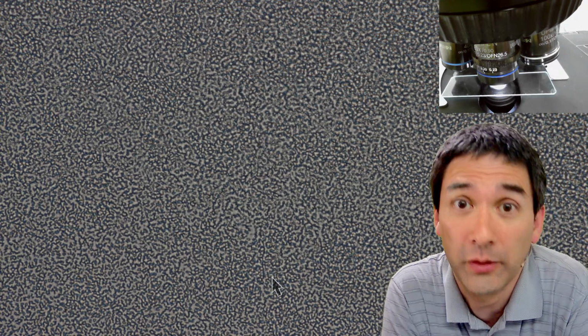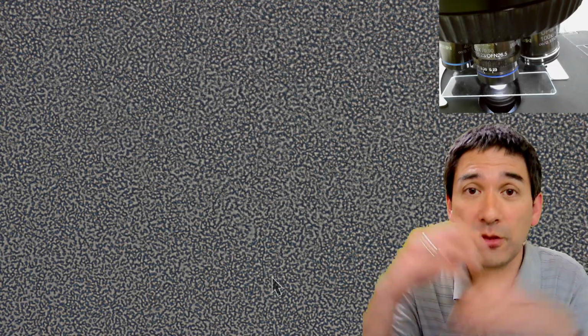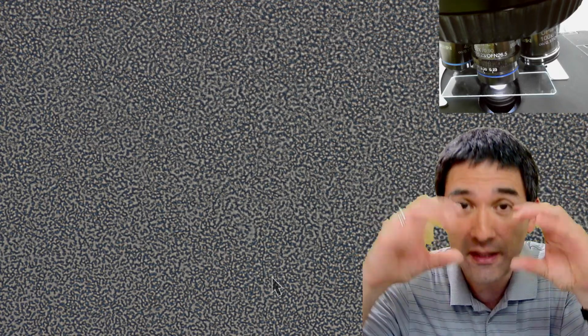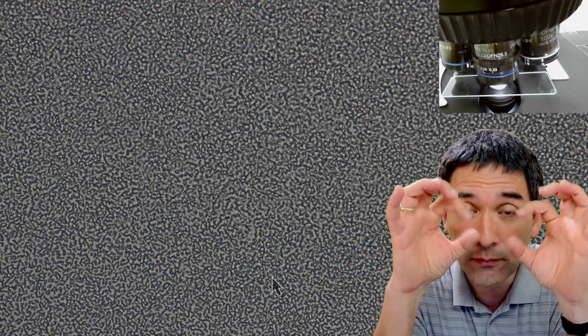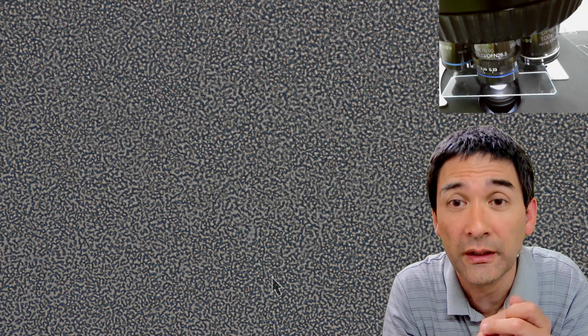That's their job, right? In this case, ergonomics is really important, especially with certain brands of microscopes. What they have is that you can adjust the height of the eyepieces, for example. Also, a very large field of view with a large eye relief, which means you don't have to go all the way close to the eyepieces. That is also important.